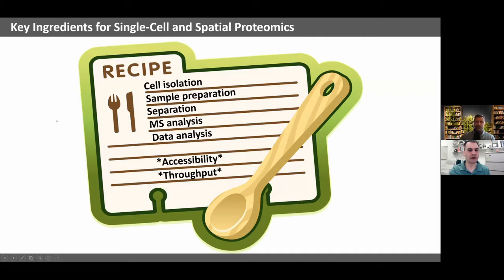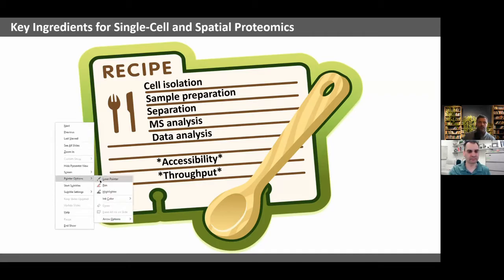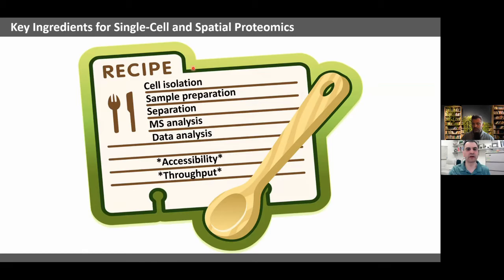So we need to optimize, bear with me, turn on my laser pointer, every step of the workflow, from cell isolation, sample preparation, we use liquid chromatography separation, and that needs to be optimized for maximum sensitivity, as does the mass spectrometry analysis and the data analysis.